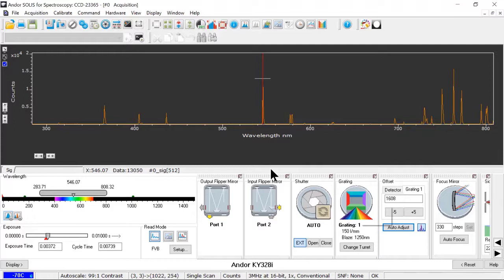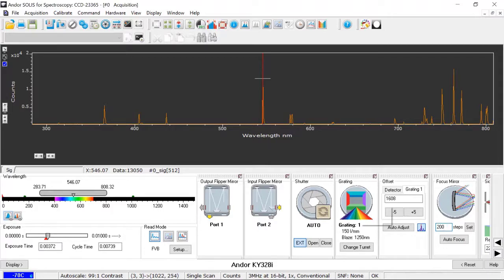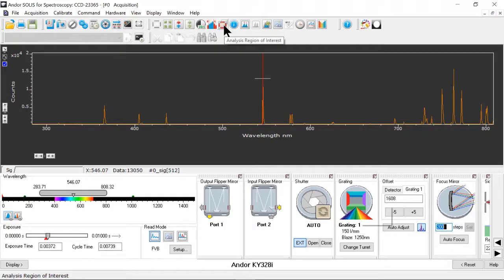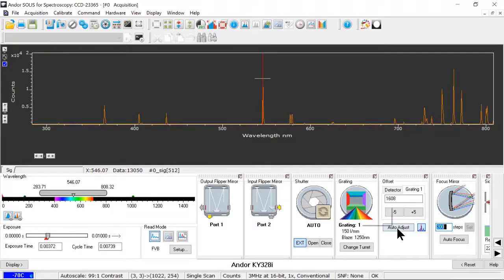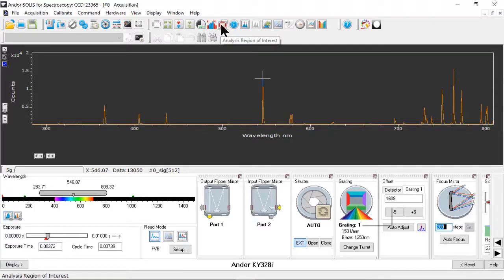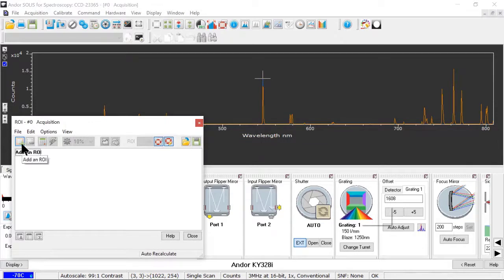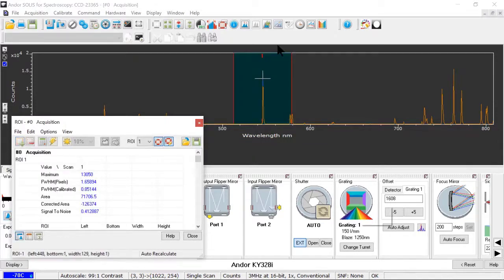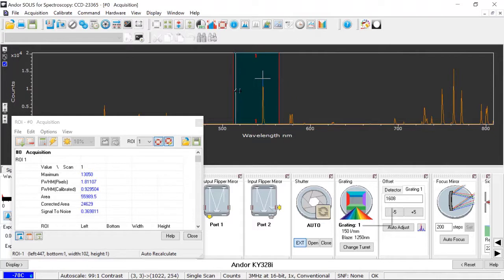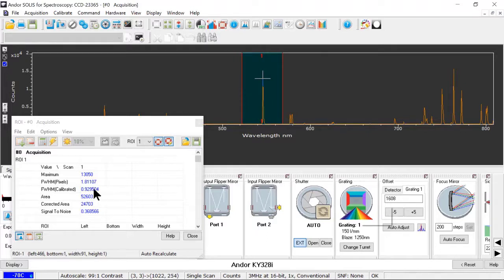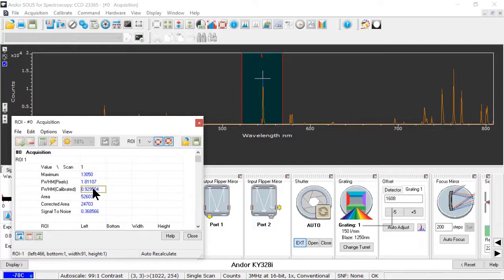The next feature I'd like to show off is our motorized focus mirror. That control is right here. So I'd like to make a manual adjustment, or I can make a manual adjustment if I'd like to. So say I'd move this to 200. That'll be quite a jump. And I'm going to quantify the width of these lines. So I'll turn off my indicator for the center of the screen, and I'll open up an ROI, a region of interest focused on that line. I'll add a new ROI. Zoom in on that particular line. It doesn't have to be perfect, but just to make sure I'm excluding other lines. I can see my full width half max calibrated, meaning in nanometers, is about 0.93. So that's saying the full width half max of my line is about 0.93 nanometers when I'm in good focus.